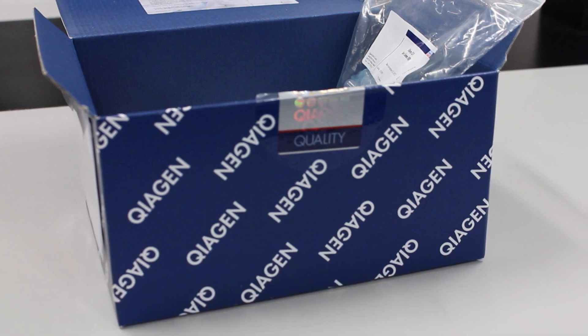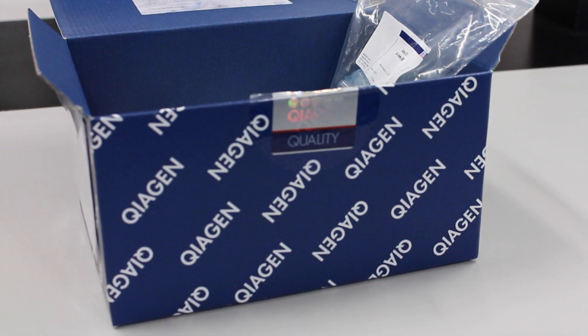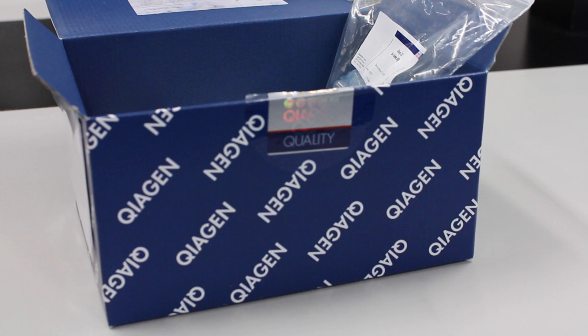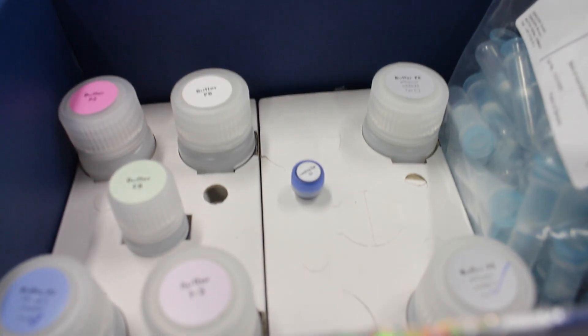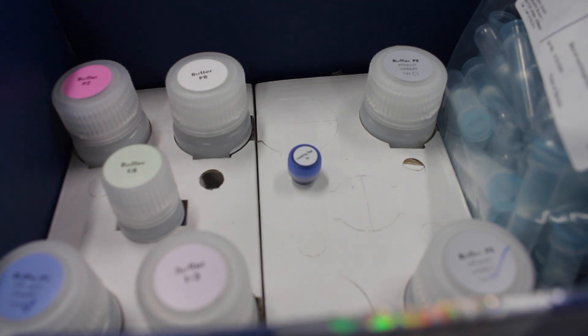Mini preps are used to isolate and purify plasmid DNA from bacterial cells. The following mini prep protocol was carried out using the QIAprep Spin miniprep kit provided by Qiagen. All the buffers required are provided in the kit.